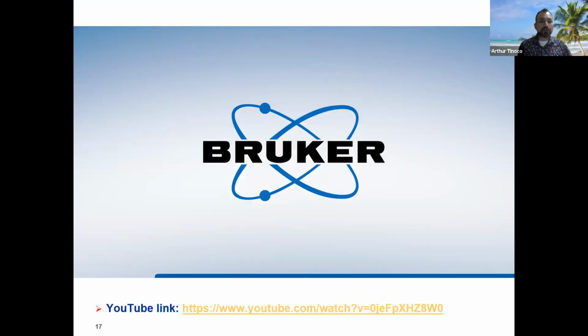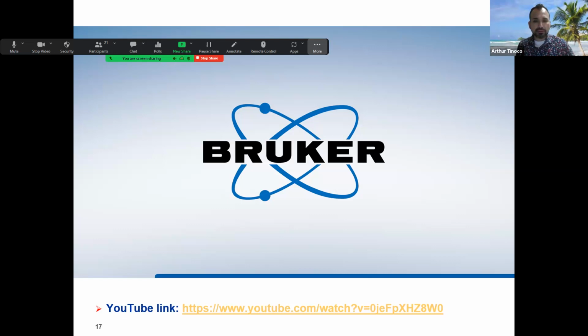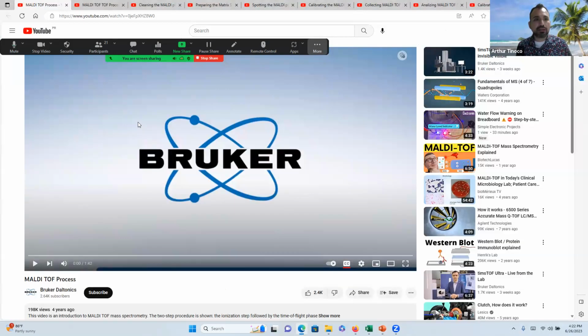So I have a video here that we're going to look at that basically shows you the inner workings of how these ions are generated and move through the inside of the instrument. So I'm going to exit out of this presentation because I want us to see the videos.